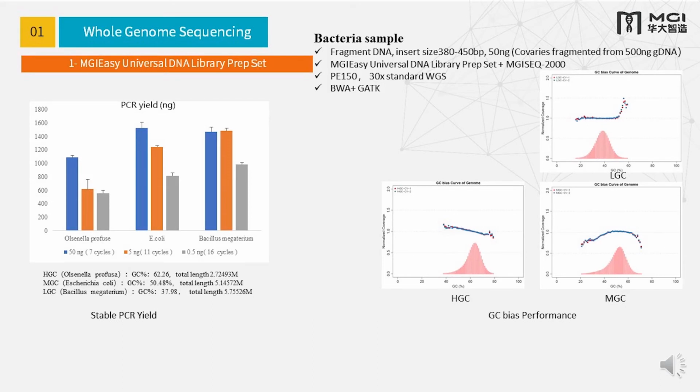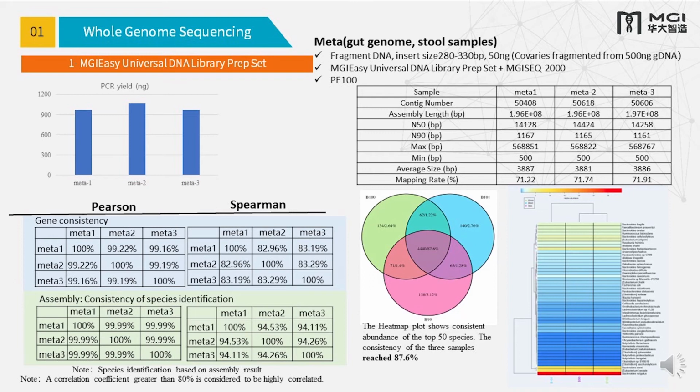And this is for meta. So the meta DNA is different from single bacterial variants, because in the meta, there are a lot of bacterial variants fused in it. So it looks like the genomic DNA. So the protocol for the meta DNA is similar to genomic DNA. You still have to do very precise fragmentation, precise selection, and also for the sequencing.